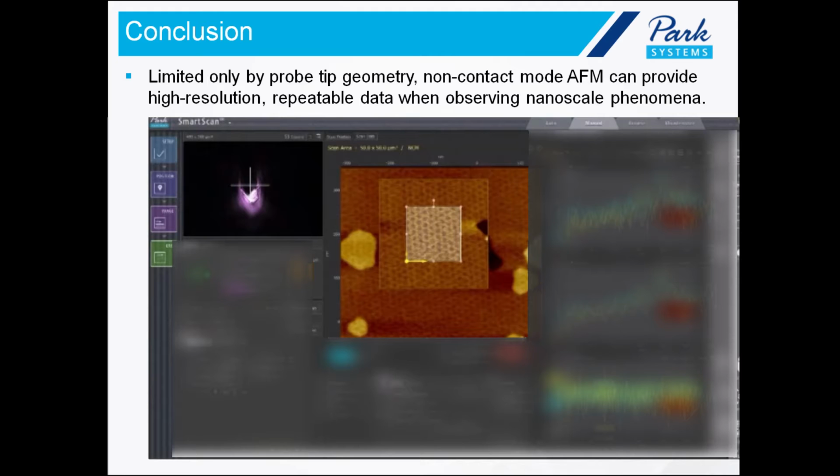So if you wanted to go as slow as like 1 hertz, you could tell it, okay, go as slow as possible, get as fine detail as much as possible from the scan, versus the other end of the spectrum, which is, you know what, I need these scans really fast. Go ahead and just blitz through the entire sample range that I've specified and collect what you can from going as fast as you can.